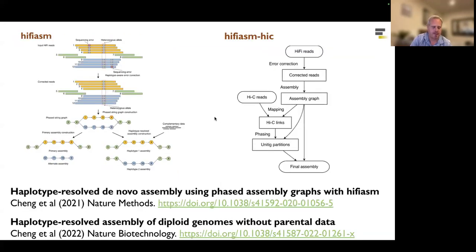And then finally, the last part is to say a little bit about the algorithms. These days there are a variety of algorithms available for HiFi data and for Oxford Nanopore data. For HiFi data, among the leading assemblers, there's something called hicanu that I referenced a minute ago. There's another assembler called Verkko. But for general HiFi-based assembly, a really good assembler, which is very fast and gives you very accurate assemblies, is called hifiasm, developed in the lab of Heng Li at Dana-Farber and Harvard.